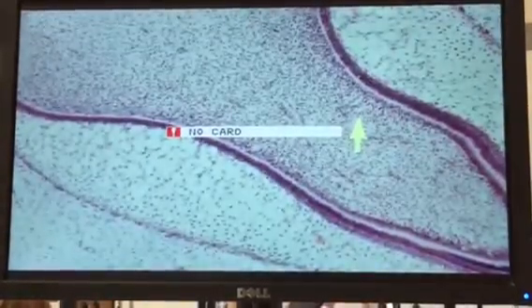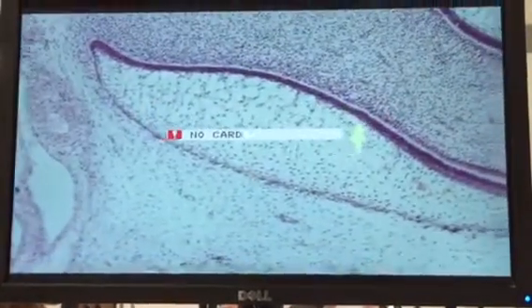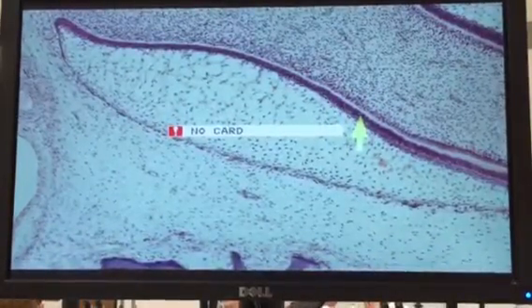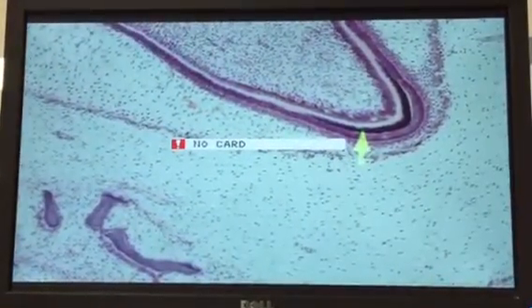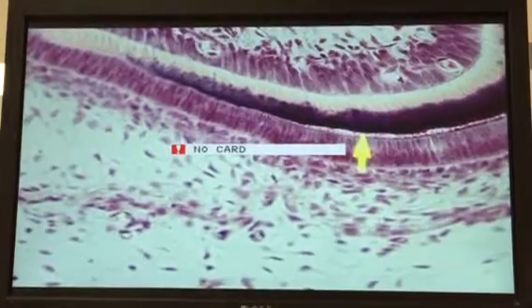Let's take a look at another slide here. Not quite as far along, but again we have morphogenic stage. Then as we come up, we see recruitment, differentiation of the odontoblasts, so we would have organizing stage in here. And then we come up, we see enamel, and then we have the synthetic stage, and again you can see Tomes processes right there. So look at those two slides. That would be slide 9.